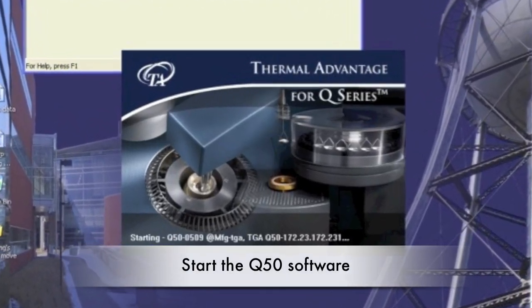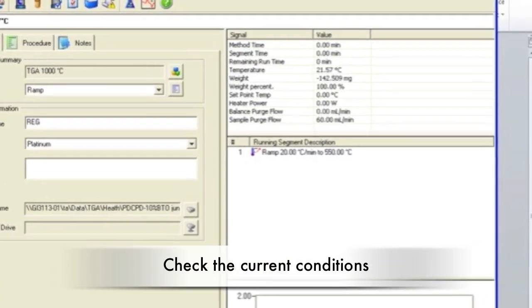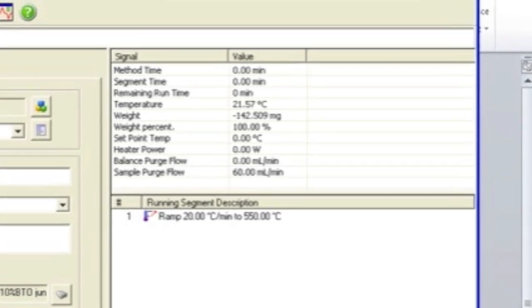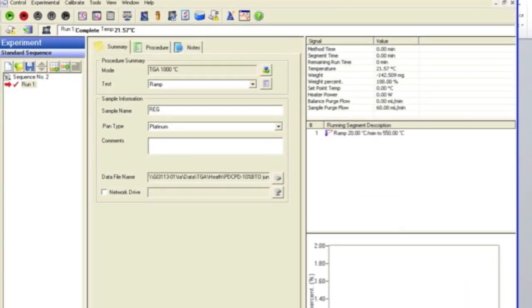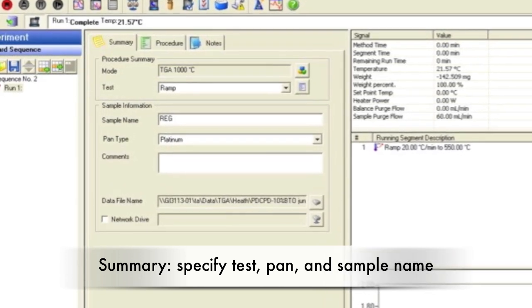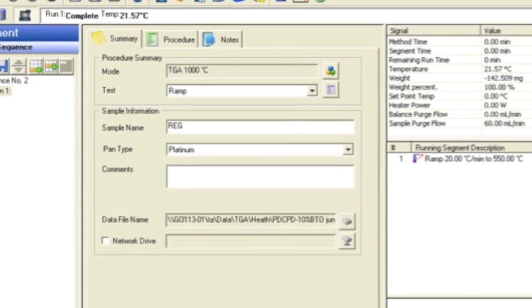Open the TA Instrument Explorer and click on the Q50 icon. Check your current conditions — the balance flow should be around 40 milliliters per minute and the purge flow around 60 milliliters per minute. In the Summary tab, make sure the mode is TGA 1000C and specify your test. Make sure the pan type is correct; use whichever pan will not react with your sample.